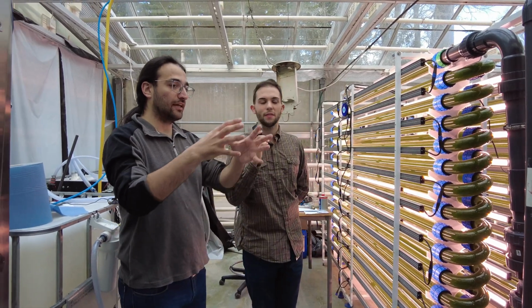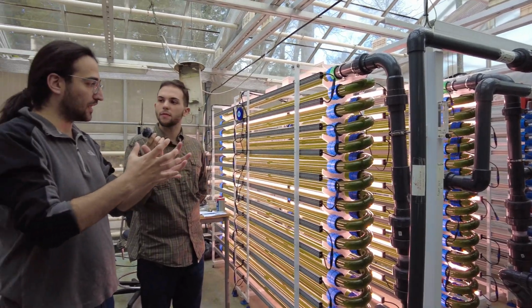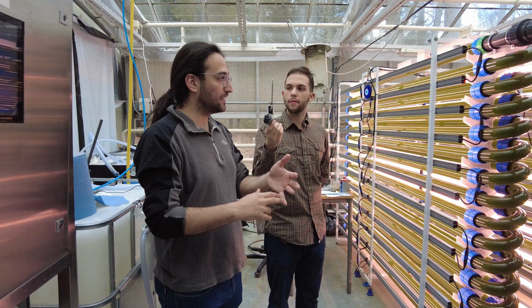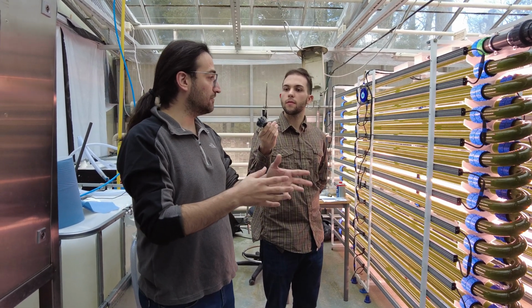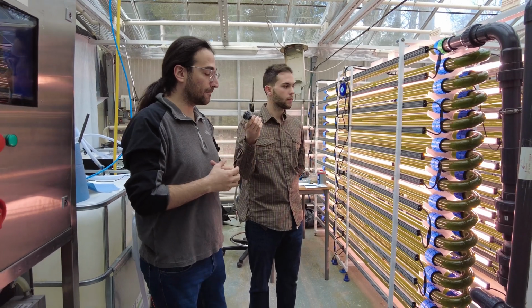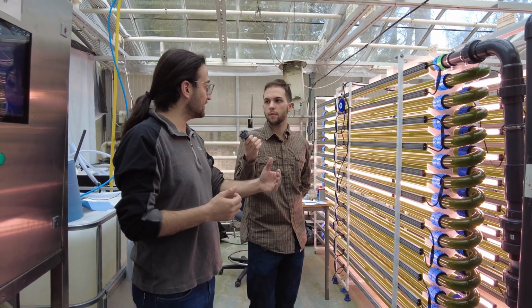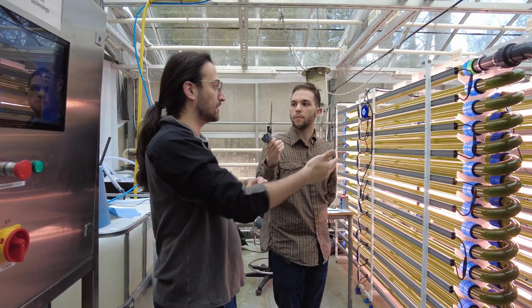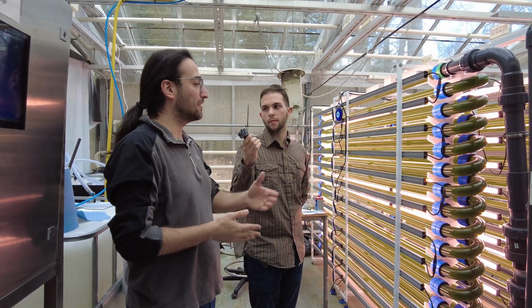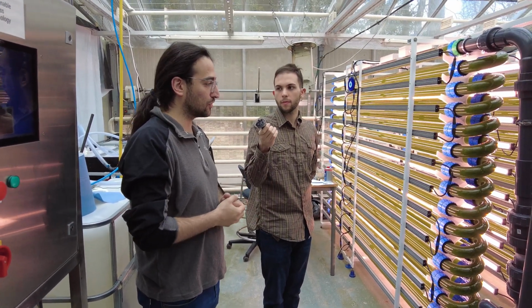Wow. In that logic, we are then storing our algae in freezers, and we know that our algae has lots of compounds inside, some fatty acids that we can use, for example omega-3 and omega-6. We can use those fatty acids in the pharmaceutical sector and also in the aquafeed sector. Which means literally we can feed our fish with algae, because it's happening in nature again. The planktons are also algae, and fish are eating the algae to get those omega-6 and 3s.